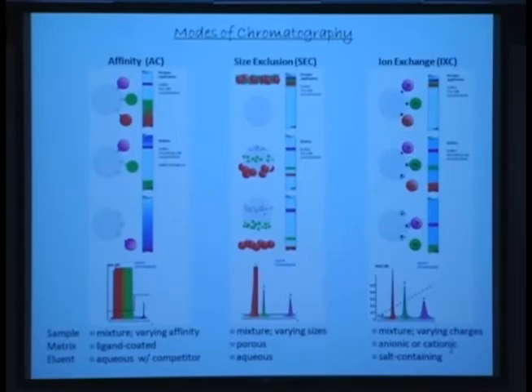It's a very simple technique. It relies on the idea that this particular molecule has a higher affinity in comparison to the rest of the molecules. It doesn't have to be the highest affinity. It can be a marginal increase in affinity also, and you would be able to see resolution. So you would get this particular sequence coming out much later. This particular sequence can then be detected, isolated, purified, and then quantified using different techniques so that we can characterize this.